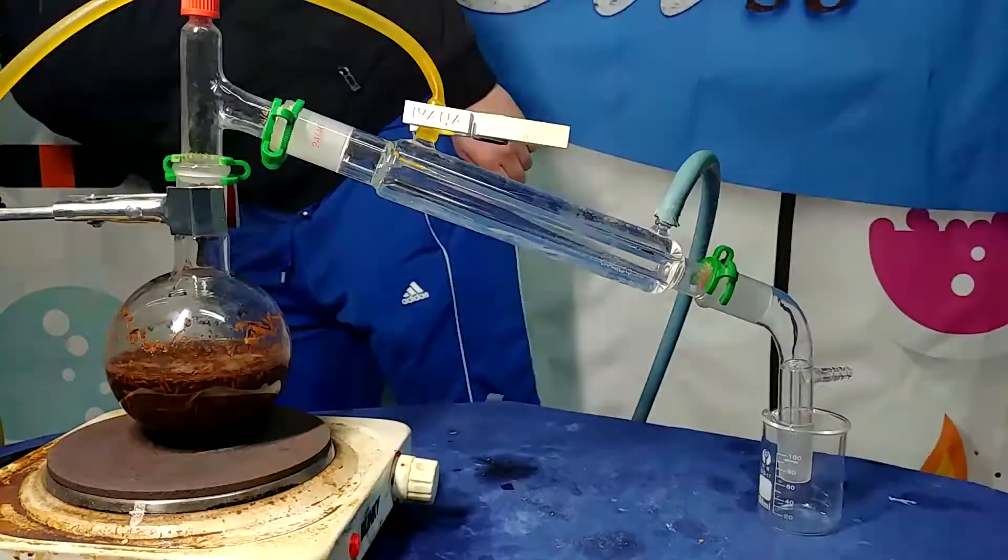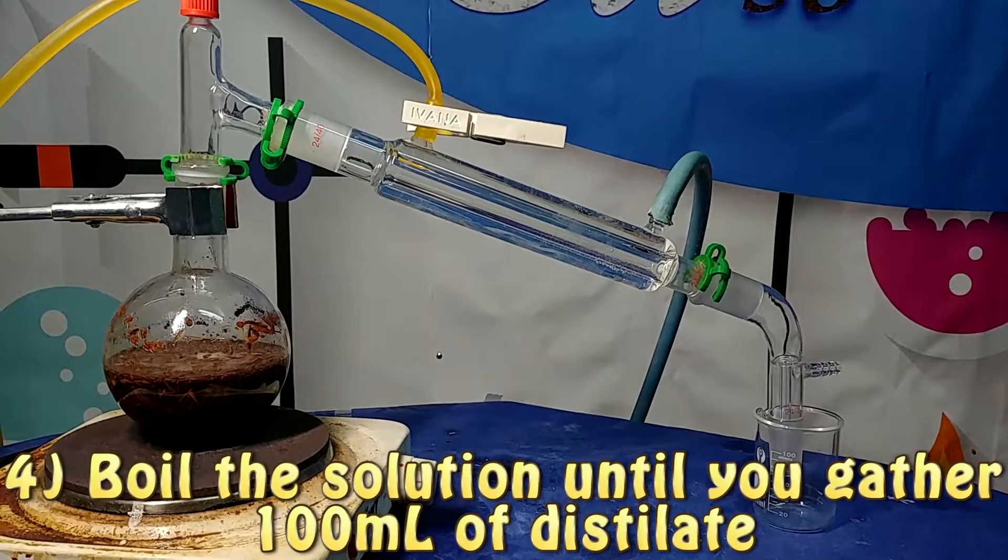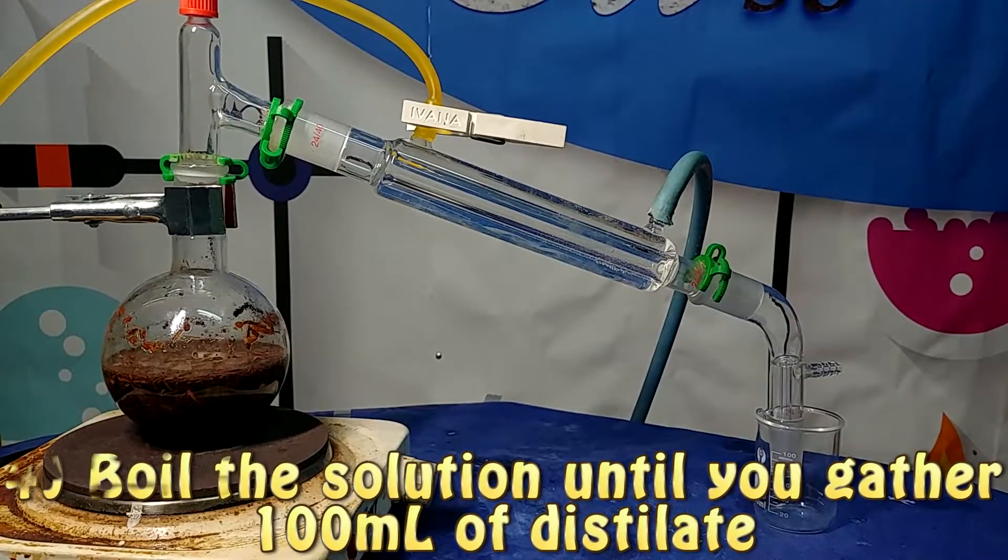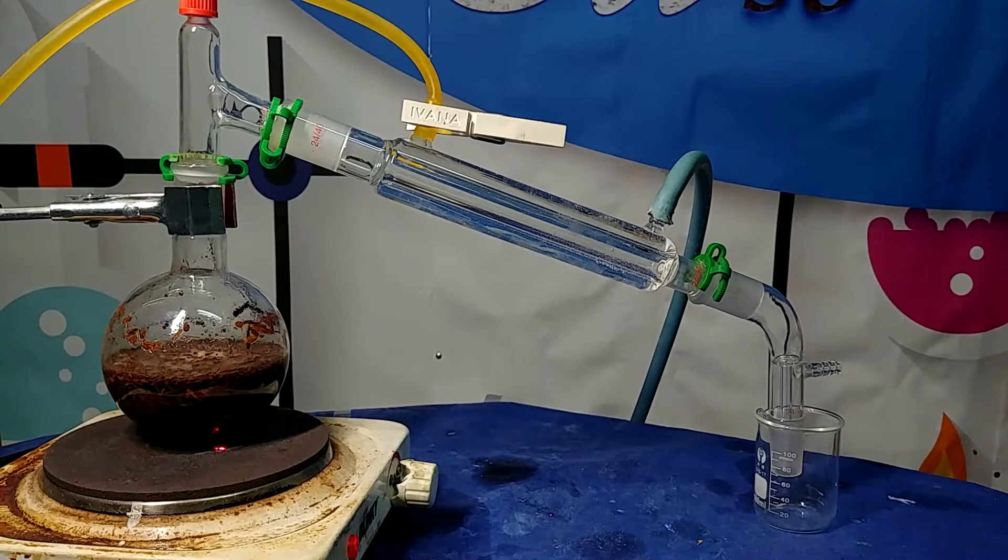So next we are going to boil this solution until we obtain 100 ml of distillate. Then we are going to put this aside and add 100 ml of water to our boiling flask.